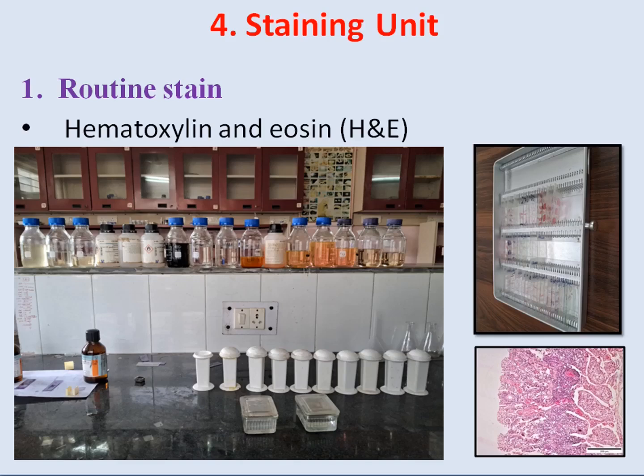Now we have to put this tissue section in xylene for clearing the tissue. After this xylene, we have to put the cover slip by applying some DPX, or you can use Canada balsam instead of DPX. You keep the slide for 1 day, and after 1 day you leave it in open air at room temperature. So it will be properly fixed, and now our slide is permanently mounted, and it has a very long life, such as 10 years, 20 years, like that.